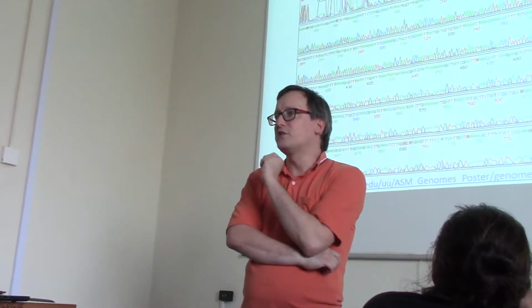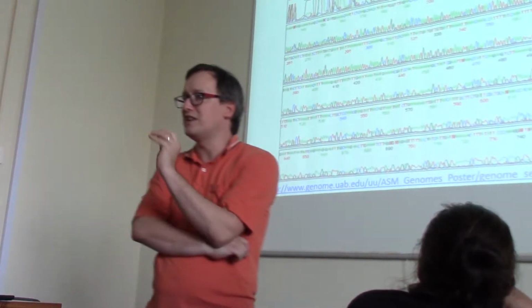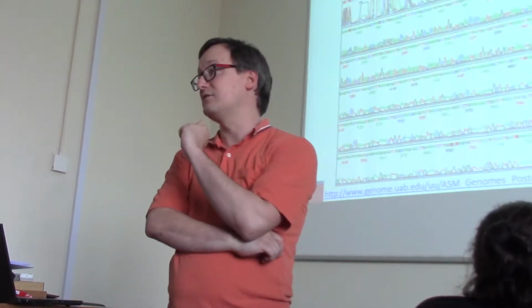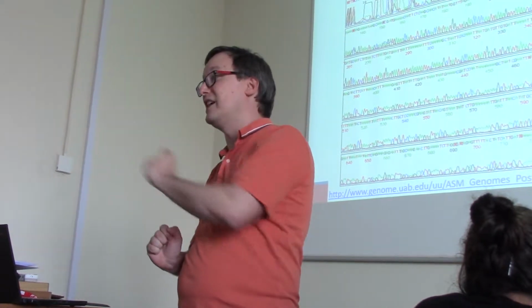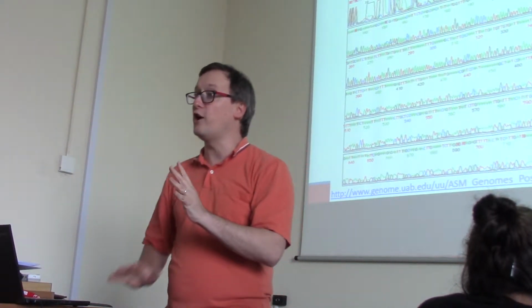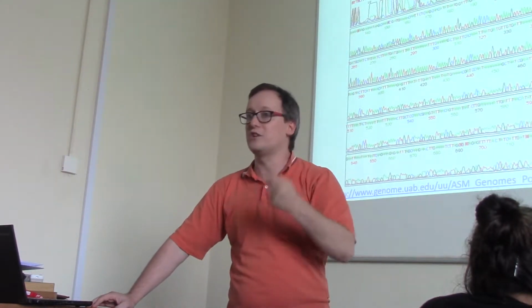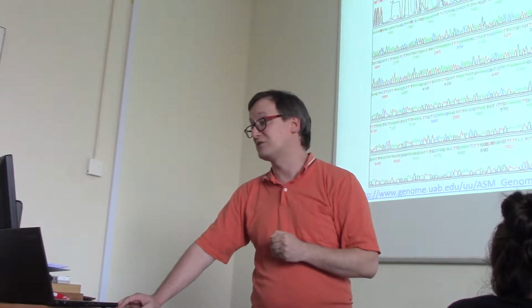Some researchers at the University of Washington realized that they didn't want to go this route, that instead they wanted to make their claims about accuracy on individual base calls. So not trying to figure out which part of the sequence we're going to accept, but rather saying, what is our probability of error associated with each letter in the sequence? That's a lot harder, and some of this was motivated by the fact that, as I said, the legislation that enabled the Human Genome Project had a specified error rate we wanted to accomplish.